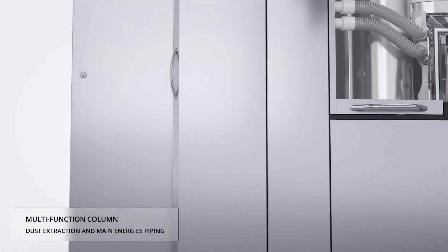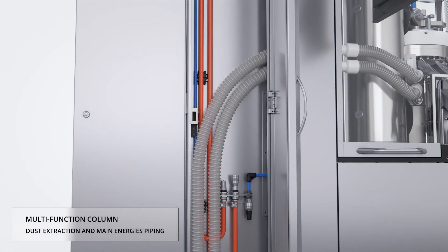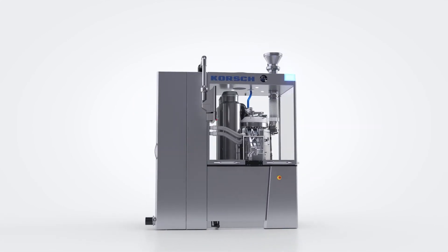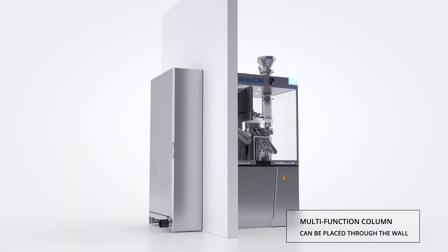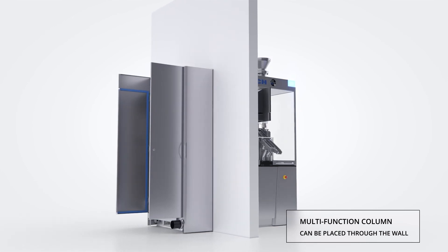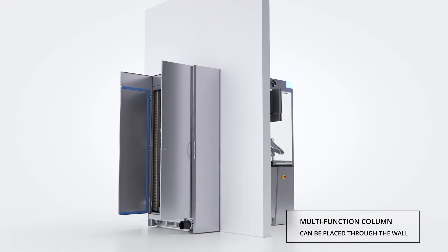An innovative dust extraction design isolates the dust extraction ducts and streamlines access and cleaning. The innovative self-contained design of the XL404 offers conventional installation in a compression suite or installation through the wall. In this case, the rear of the machine is placed through the wall, and the service of the electrics and main energy connections can be done from the technical zone with no disturbance in the production zone.